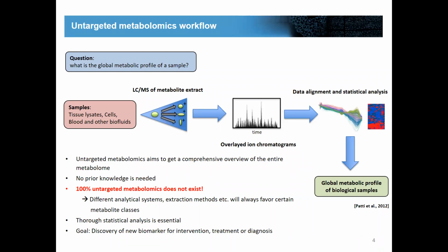Of course, like I mentioned, a thorough statistical analysis is absolutely essential. And in the end, the goal of an untargeted approach often is the discovery of a biomarker, which is significant for the intervention or for a treatment, or can also be used in diagnosis.